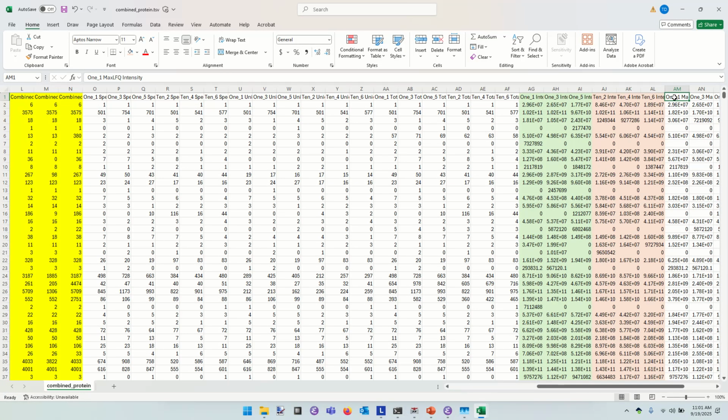One of the very nice features about IonQuant is that it has the ability to detect false quantitations. False quantitations, which means that I might be checking for the intensity attributable to a particular peptide in this raw file, and yet what I see is random stubble. Now I can integrate that noise and give you some very low value, but it's probably more correct to say that this is a false quantitation and thus provide a zero. So is it plausible that some amount of this protein is present but it didn't rise above the noise level? Yes.